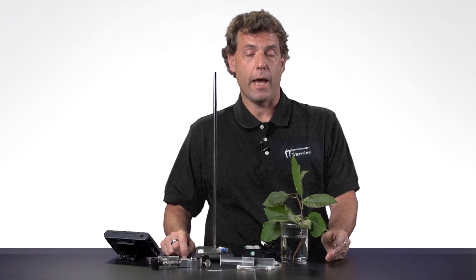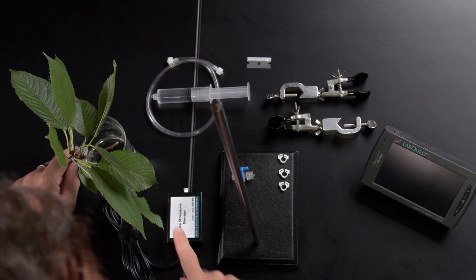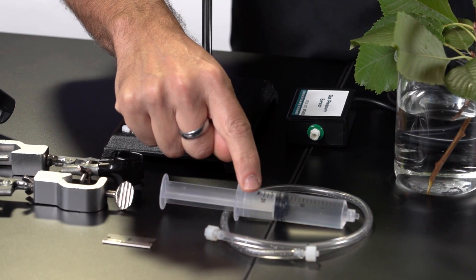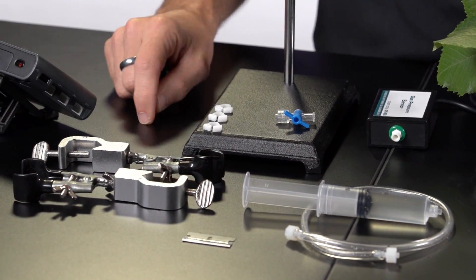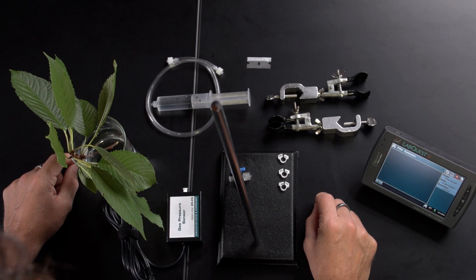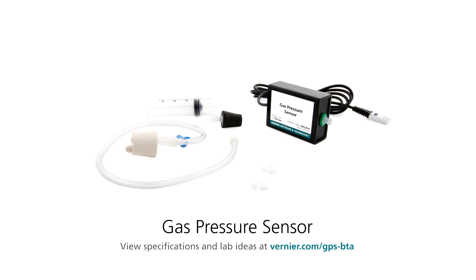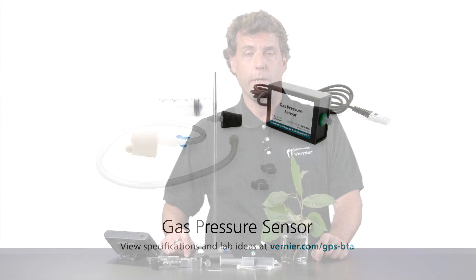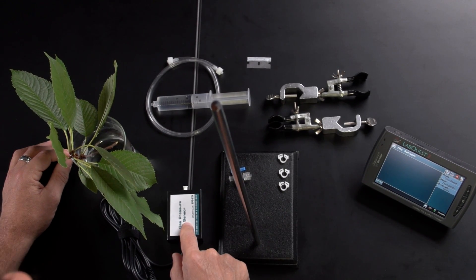If you use scissors, you're going to crush it, and that can be a real problem. The other things that you're going to need to do this lab are a gas pressure sensor, a syringe, some tubing, a little stopcock, some hose clamps, two utility clamps, a stand, and in this case I'm using a LabQuest 2. All of these smaller items — the syringe, tubing, lure lock, hose clamps, and stopcock — all come with a gas pressure sensor, or you can buy them separately as the gas pressure sensor accessory kit.